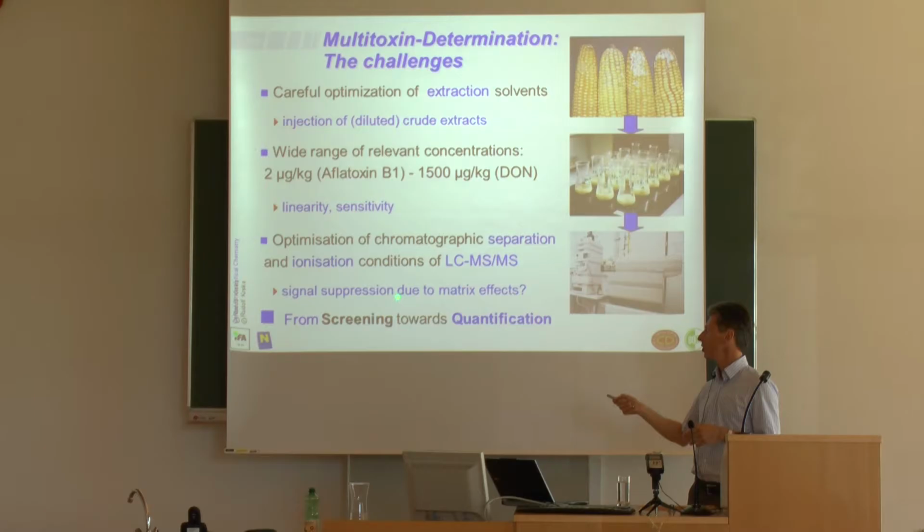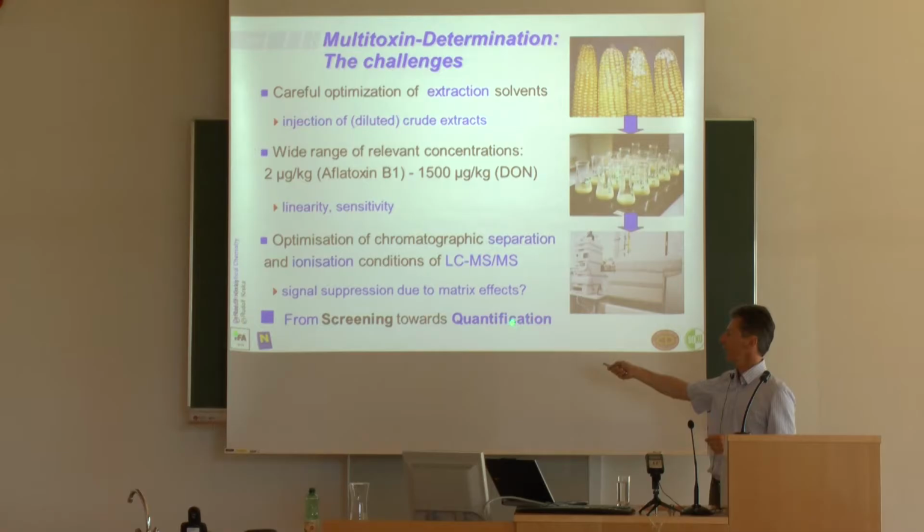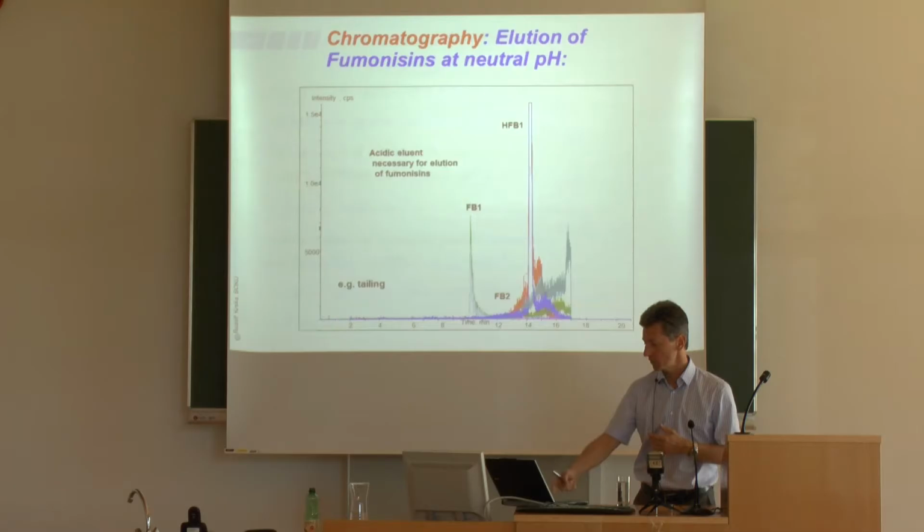That cannot be discussed in every detail in my short introduction here. You will learn about this during this week and also during next week. And certainly we go from screening towards quantification. It's not only that we can say qualitatively this compound is there, we can actually quantify the concentration, and that is what counts.